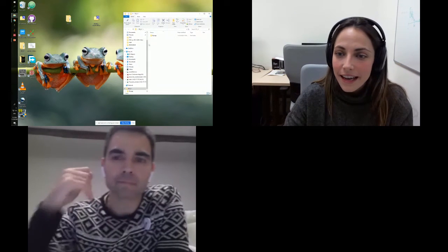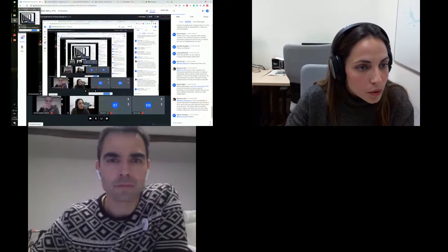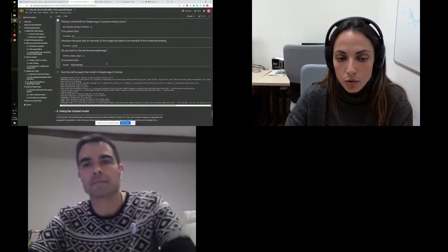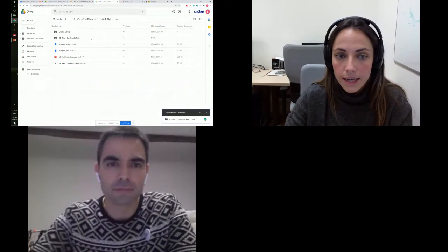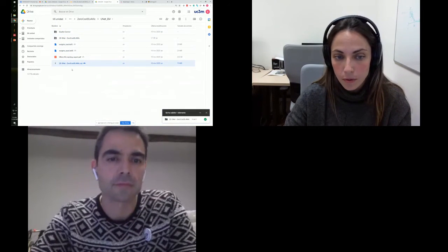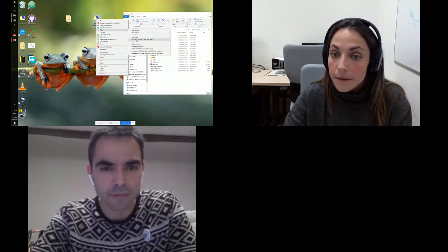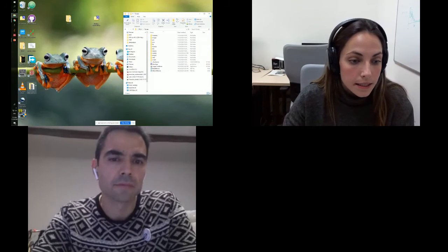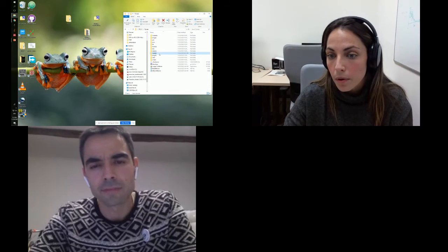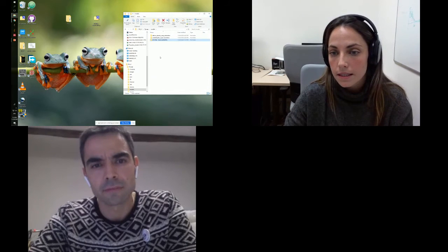Okay, here I have my Fiji application. First maybe I can show to you the notebook executed that Romain showed to you, but with some more iterations. Here I have the output files, and this one could be the zip file that I need to download. Once I download it, I have it here, so I can just unzip it. And this is my Fiji folder. So I have my models folder here. If you don't have one, you can just create it. And I can place this one just there.